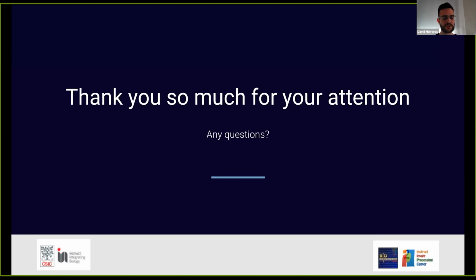And then for the consensus, yeah, I have gone very fast over it, but the idea is that you provide as an input different estimations from different programs, or even the same one several times. And what you are getting is an error measurement for each of these different algorithms. Of course, these error measurements are going to be related to each other, right? Because what we are trying to do is to move all the programs into the same space.